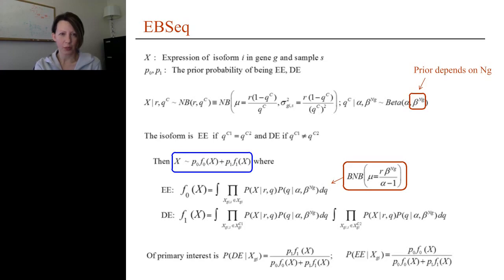Those are two points about the specific model parameterization that we use, but I want to make a few points about mixture modeling in general. The first, which we see in this blue box, is that I have a two-component mixture model, because there are two options for the ways in which these latent means can sort themselves out across condition. But if I had 3 conditions, let's say, then there are 5 ways in which the means can sort themselves out. They're either all the same, or they're all different, or the first one differs from the other 2, or the middle one differs from the other 2, or the last one differs from the other 2. So there are 5 ways in which latent levels of expression sort themselves out across conditions when you have 3 conditions. In that case, we can easily introduce a 5-component mixture model, and we can evaluate in the context of this framework the posterior probability that the gene or isoform falls into any of those groups.